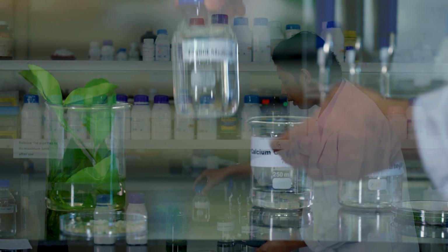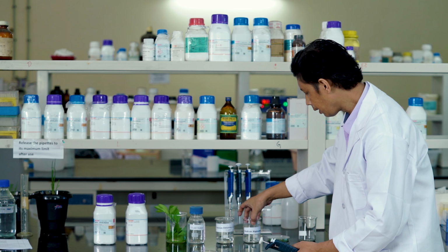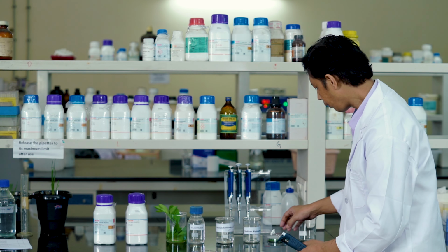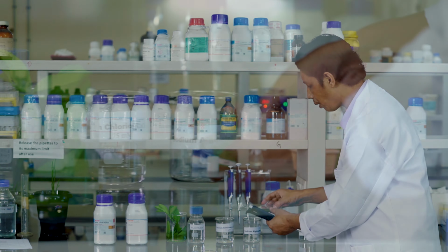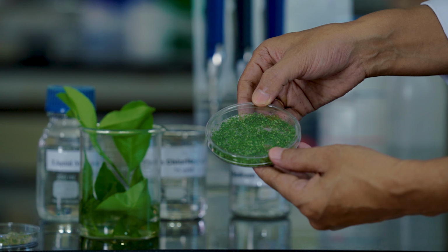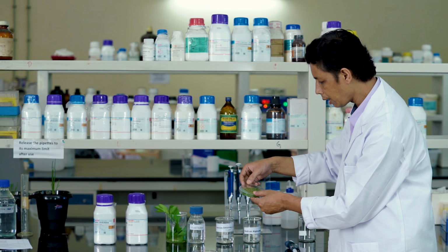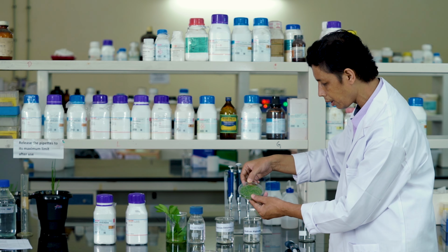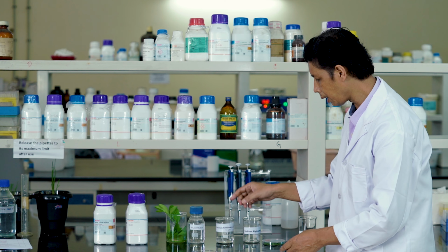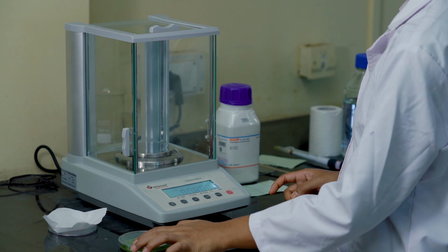Then we need the liquid medium. Then we have these beakers, in which we will measure these chemicals and dissolve them. And finally, we need the somatic embryos out of the explant plants which we have collected. These somatic embryos were generated from the explants collected earlier, as you can see here. Now these somatic embryos will be encapsulated using these chemicals. Now I will describe the protocol step by step.